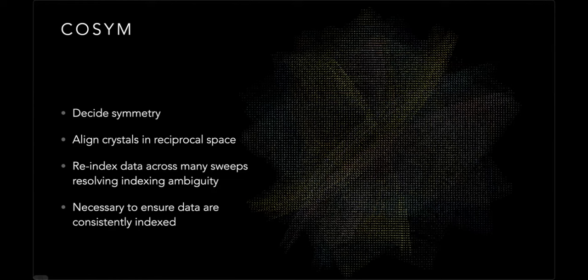One of the things that you may be familiar with if you are doing multi-crystal data processing is that quite frequently you can only measure, say, 5 or 10 degrees of data from each crystal. If you're in that situation, it's actually really hard to derive the correct symmetry from that individual sweep, because all you can do is index it and go, well, it kind of looks tetragonal-ish, or cubic-ish, or hexagonal, but you really have no idea because you haven't got enough symmetry-related reflections. Unfortunately, to scale the data, you need to know the correct symmetry.